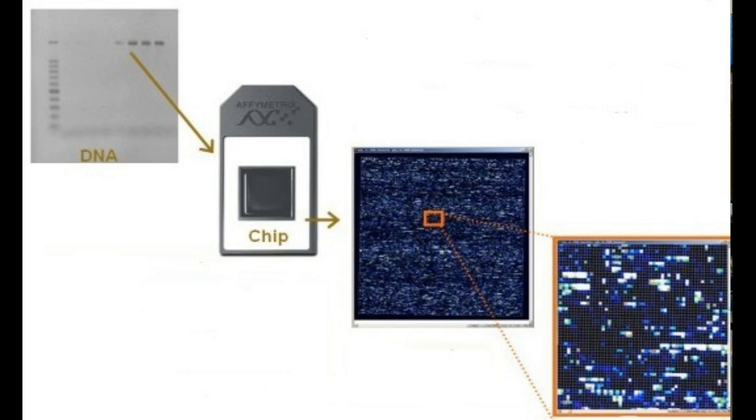of bacteria and archaea. A typical experiment includes the isolation of DNA from environmental samples and the amplification of the 16S rRNA gene by PCR with the use of universal primers. Then the amplicons are fragmented and stained with fluorescent dyes. The next step is the hybridization with the probes that are embedded on the surface of the chip. Finally, the chip is scanned and the resulting data is analyzed with the help of specialized software.